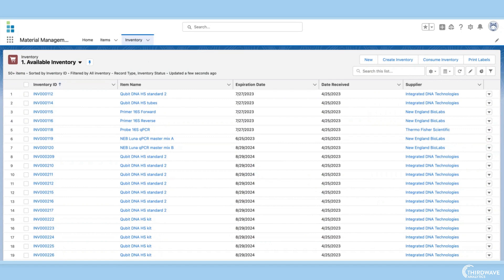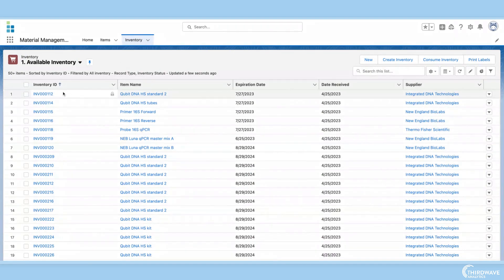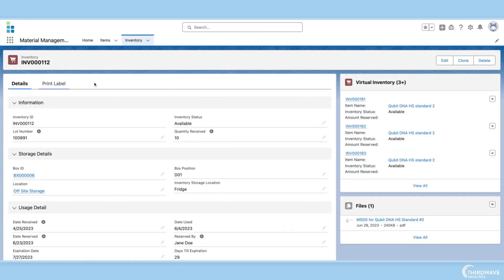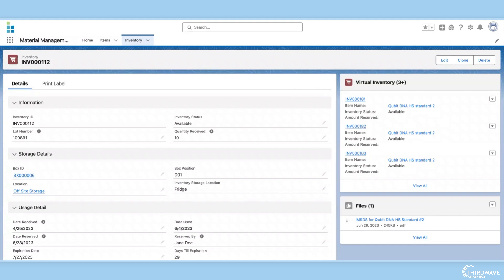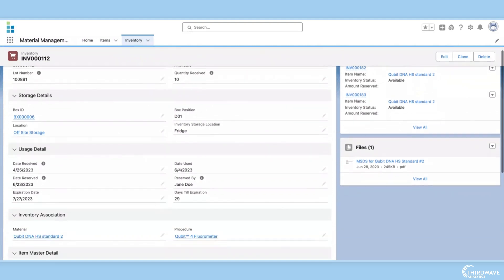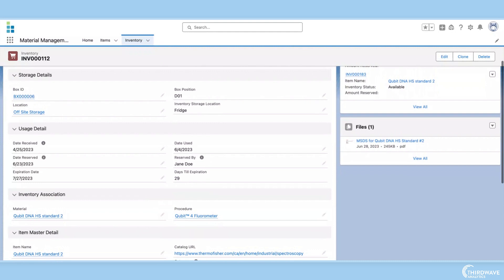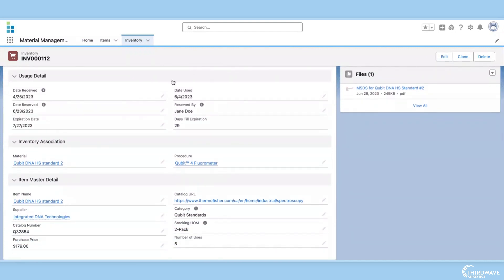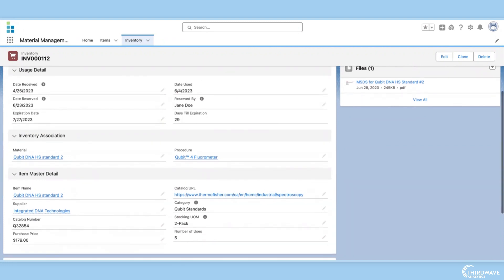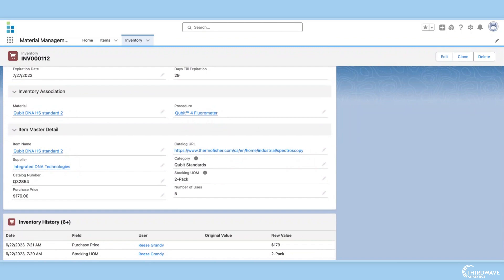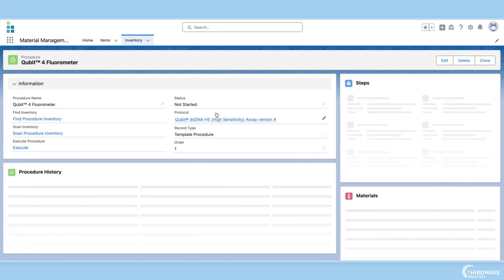Once complete, these items are added to the inventory records. We can click any inventory record to view the inventory record page, which provides the lab techs with all the information about the physical inventory. Here we can see where the inventory is stored, when it was received, when it was last used, who used it, and when it will expire. We can also see if the inventory is associated with any procedures.